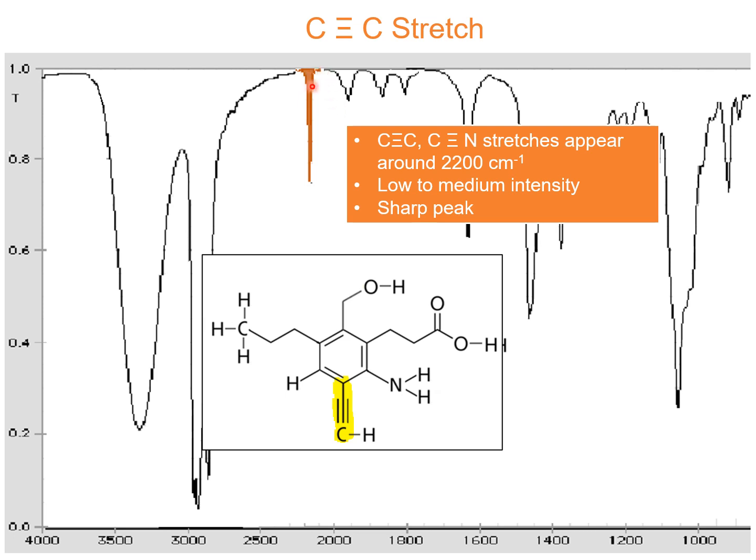They are usually of low to medium intensity, but they are very sharp, very fine compared to the other peaks. And usually this region in the IR is not occupied by any other peaks. There are no competitors, no other functional groups which can appear in this region. So if you have spectra in front of you, and there is any peak between 2100 and 2300, it is surely because of a triple bond.